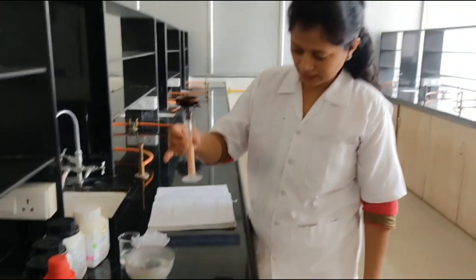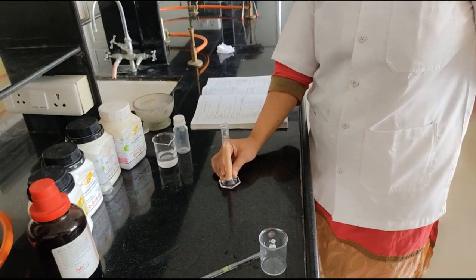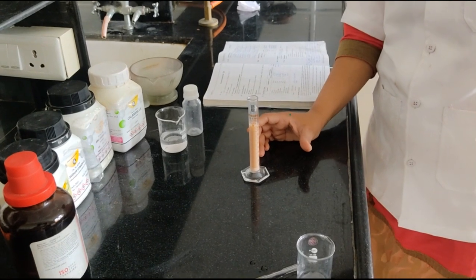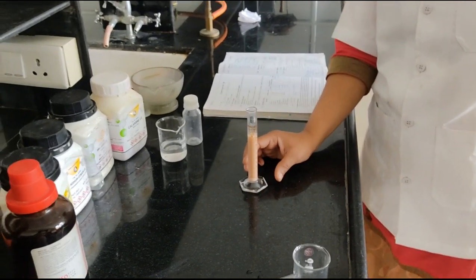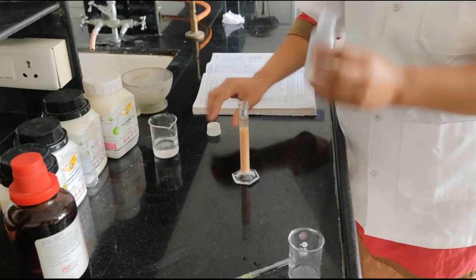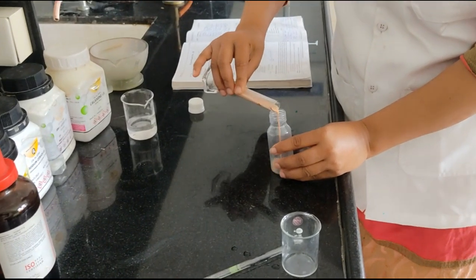This is our calamine lotion. Then pour this calamine lotion into a transparent suitable container. Our calamine lotion is ready. We prepared only 10 ml of calamine lotion. It should be stored in a cool place. Do not freeze. For filling the calamine lotion, we use a transparent container. Pour our calamine lotion.